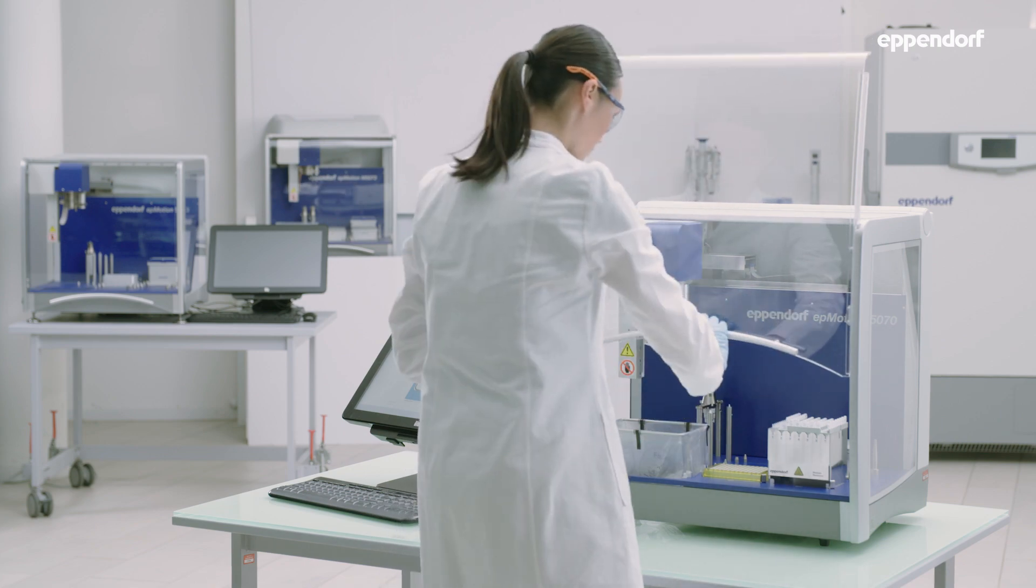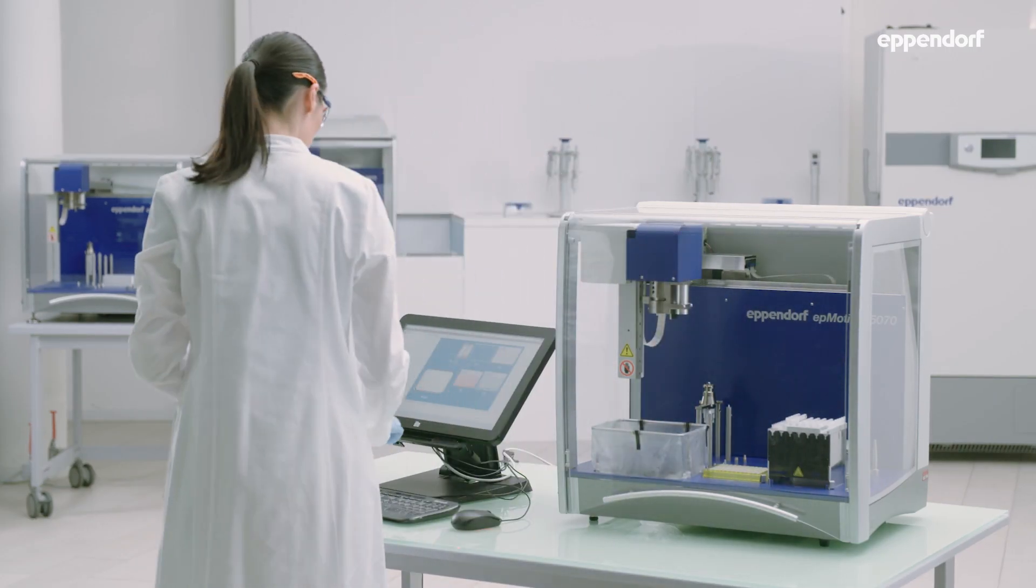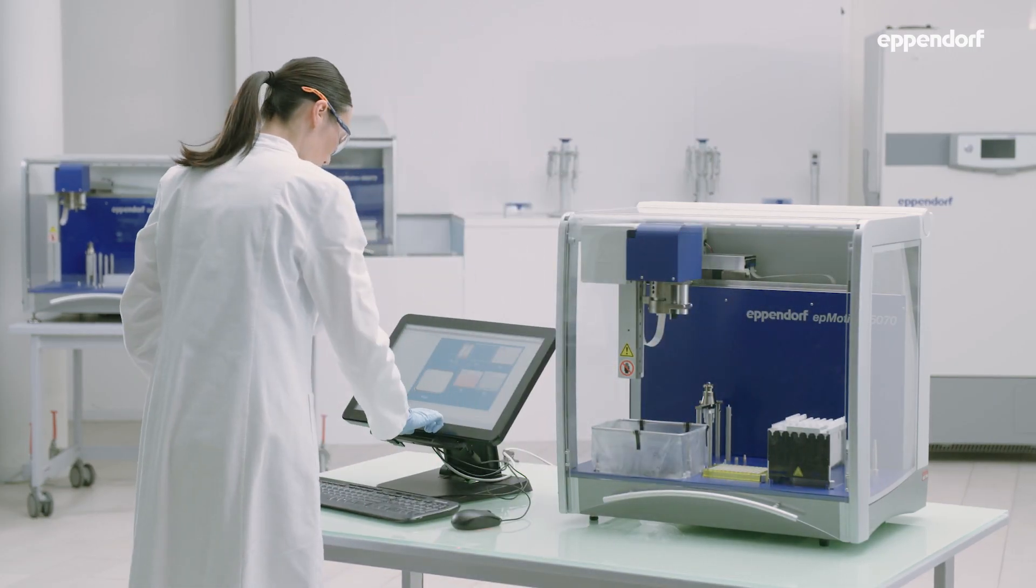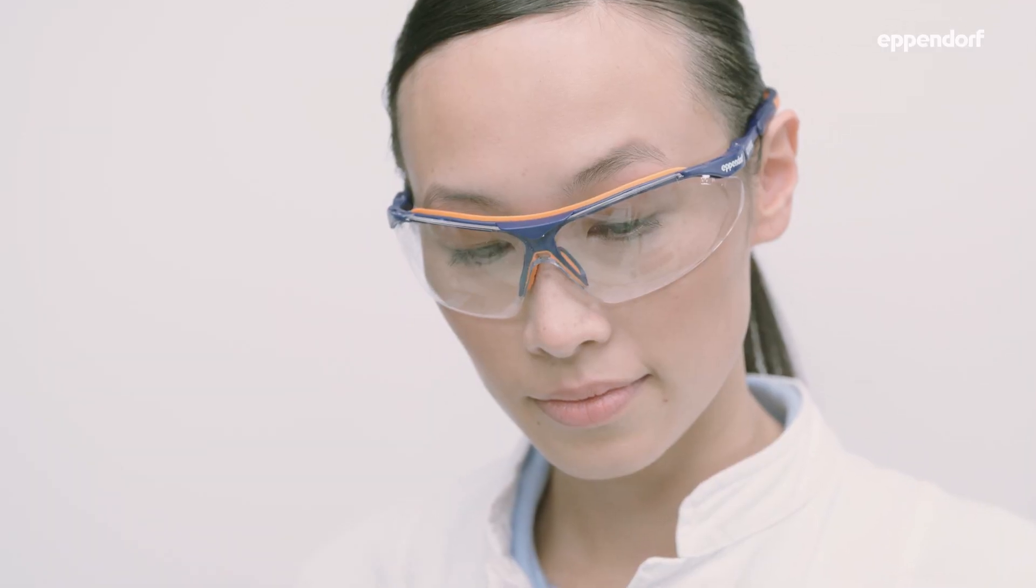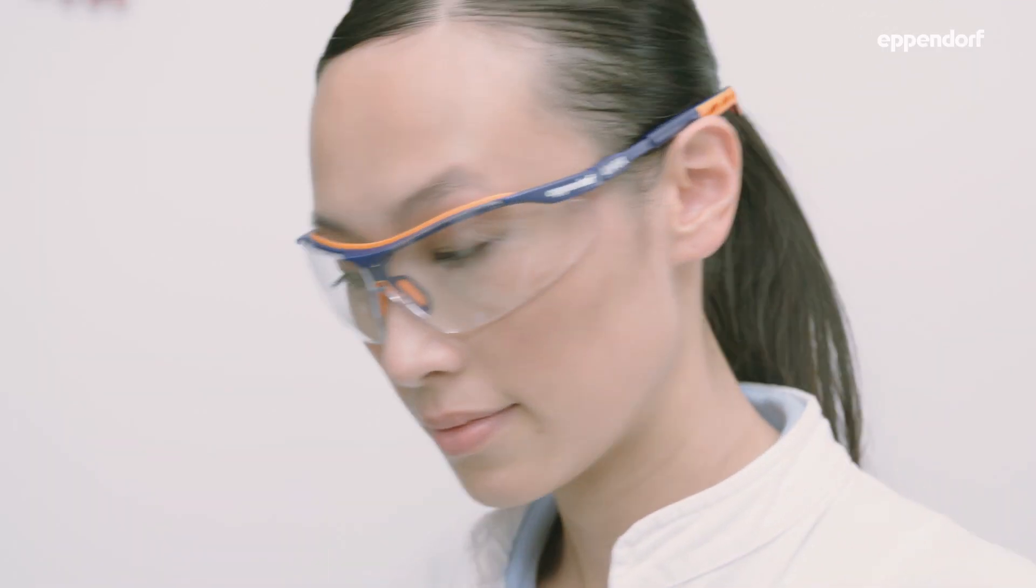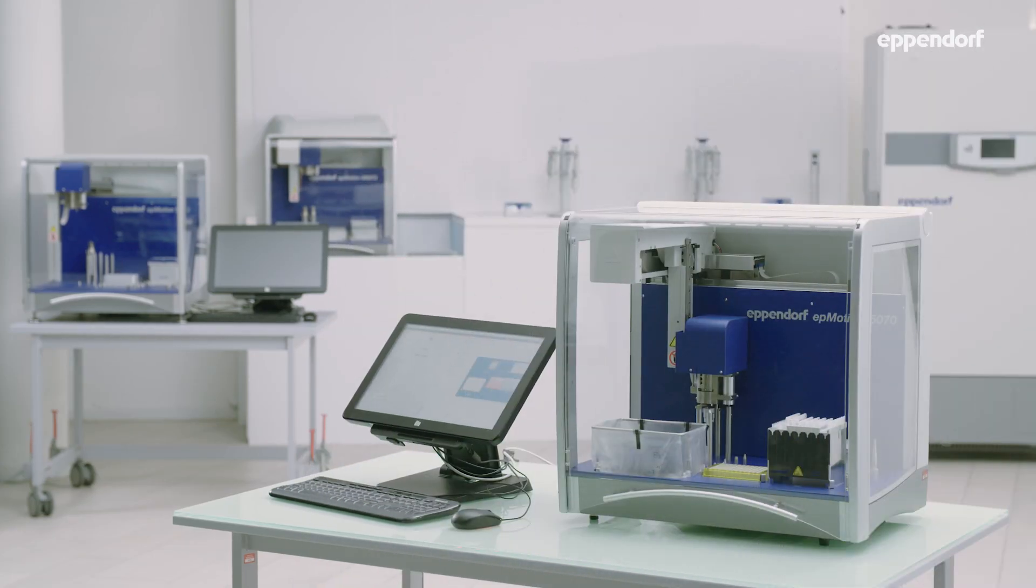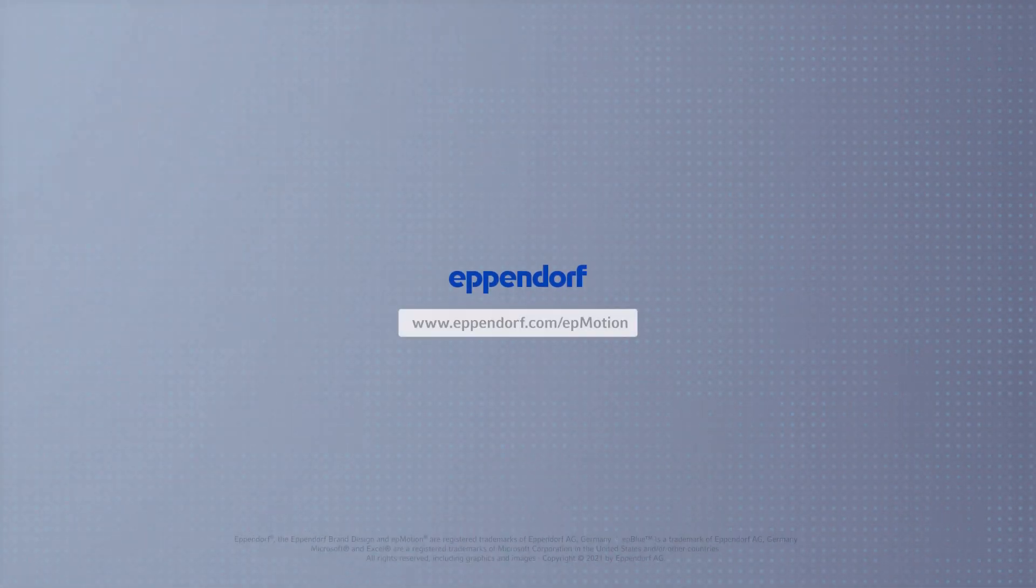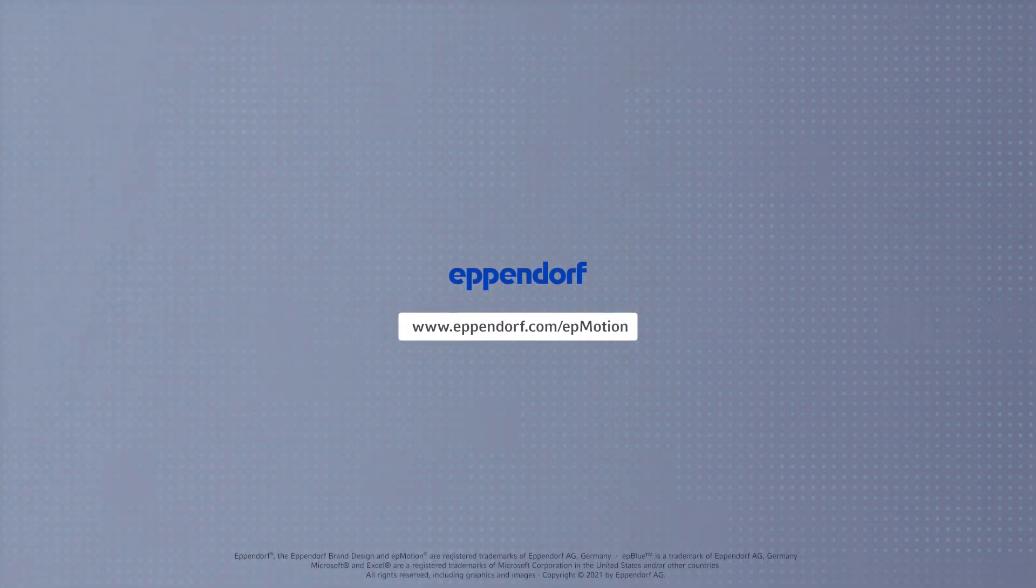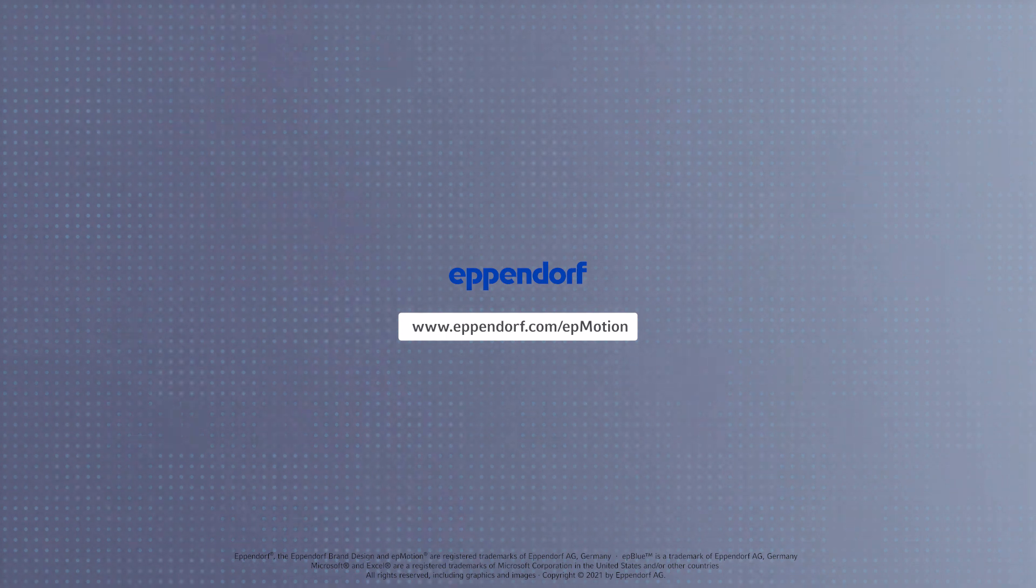Now the PCR setup is programmed and the EPMotion can be started to set up your PCR reaction with maximum reliability and reproducibility. For more information visit eppendorf.com slash EPMotion.